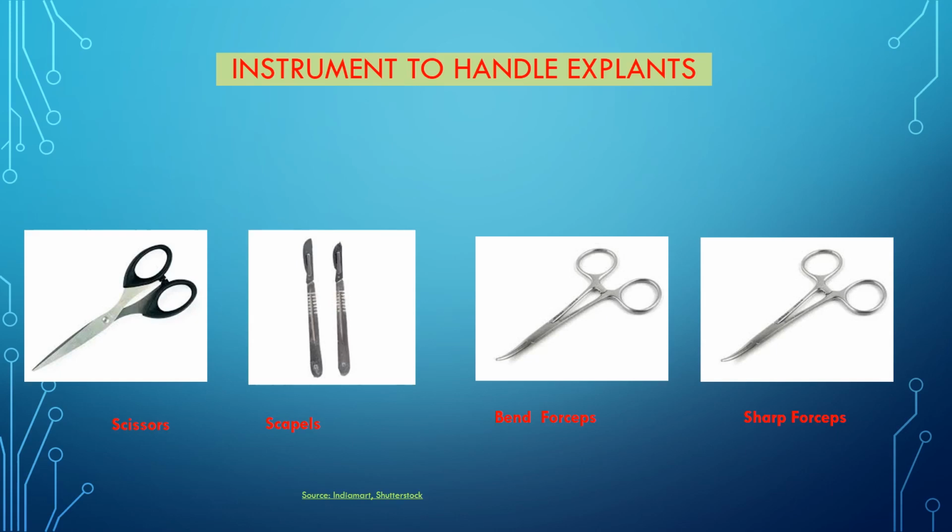To cut the explant, scissors and scalpels are used. To prepare the explant to be cultured, bent forceps and sharp forceps are used.